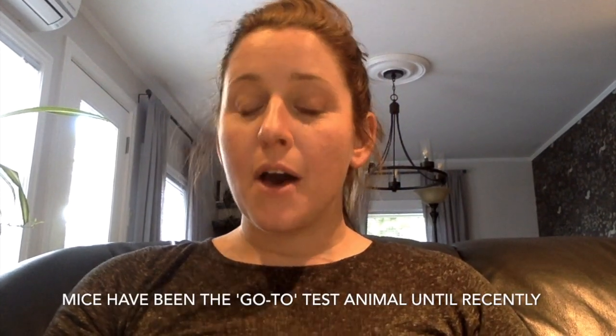Okay, a couple of interesting things about zebrafish. We can genetically modify them to more readily study how cancers and different types of treatments behave in them. And they have 70% of the same genes as us. So that's lower than mice, who have around 85% of the same genes as humans. But of course, the zebrafish are a fraction of the cost and grow way faster. So they even have clear ones, so you can see what's going on with their vital organs at any given time.